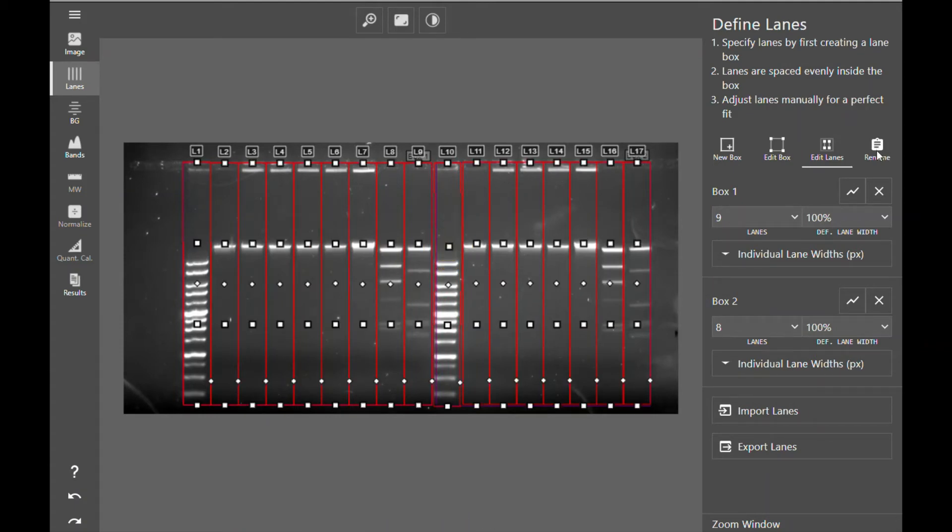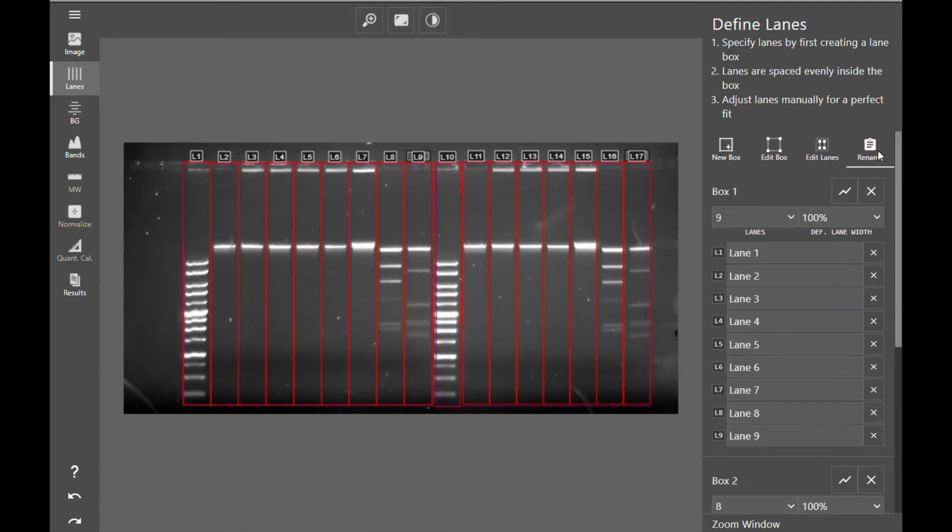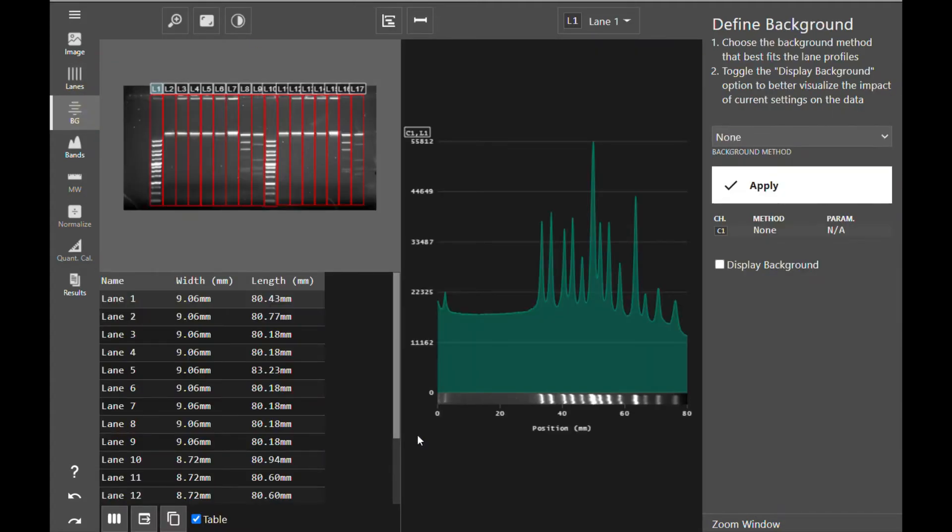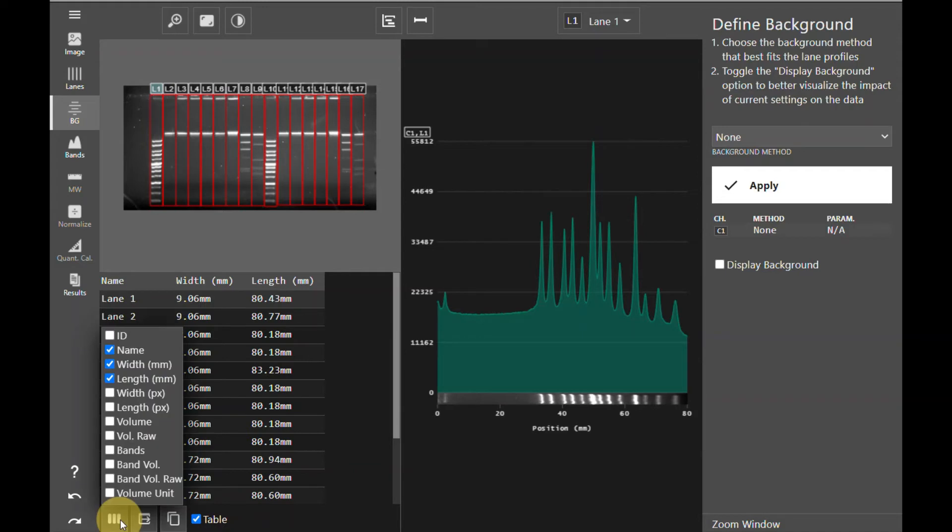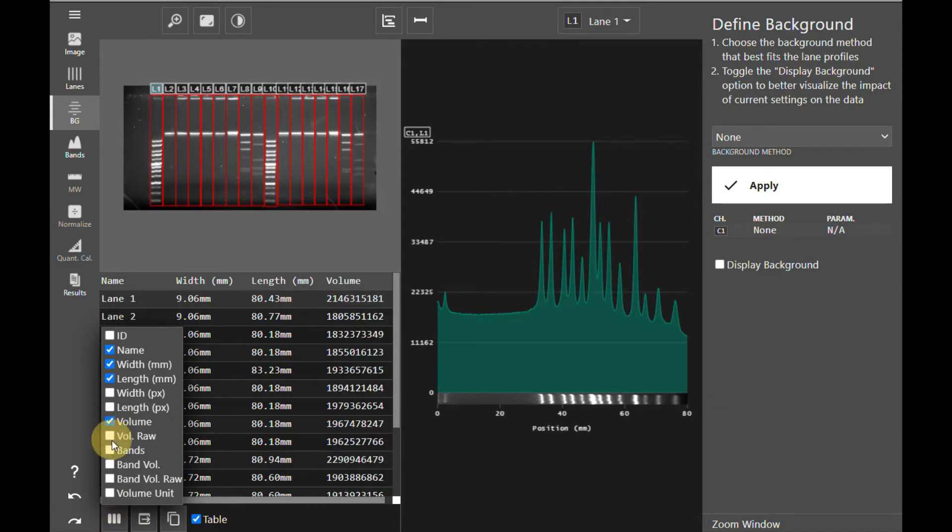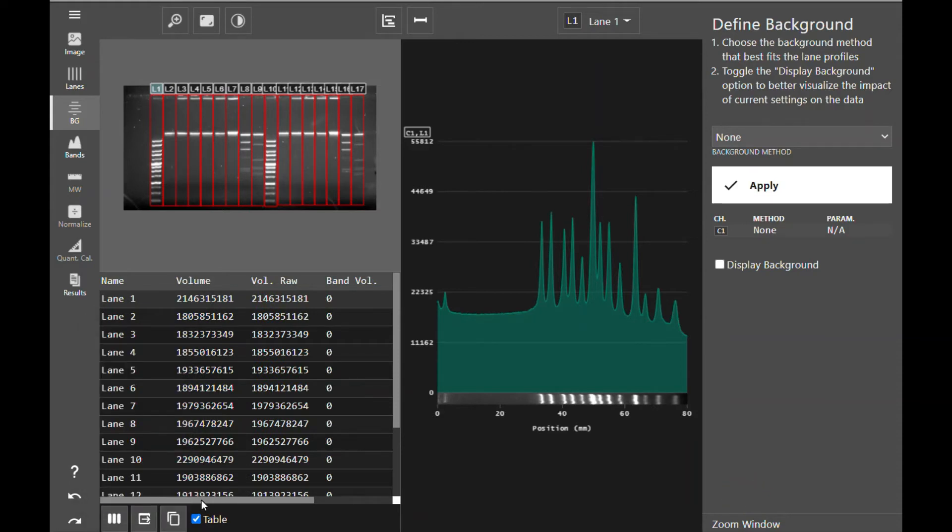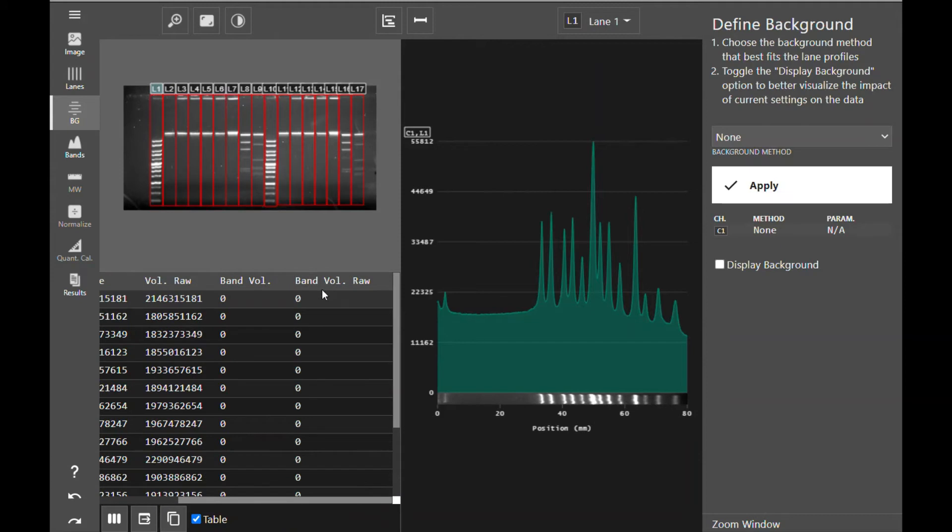At this point, you can also rename your lanes in order to annotate your image further. Once you are satisfied with your lane box and individual lane placement and manipulation, you can move on to the next step in analysis, which is background. When you enter the background definition tool, you'll notice a data table appear. You can select what data is displayed in the table by clicking the choose columns icon. In this case, I'm going to select to view my volume and my raw volume, my band volume and my raw band volume. So you can see there are now columns for the volume and the raw volume, which at the moment are the same, as well as columns for the band volume that we will get to when we get to the band tool.